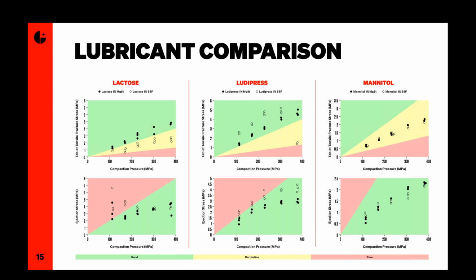But also I focused on just showing you these graphs because they're both independent of the material true density value. If you don't have the material true density value on hand, you still have both of these pieces of information. And I think this example shows how useful they are.